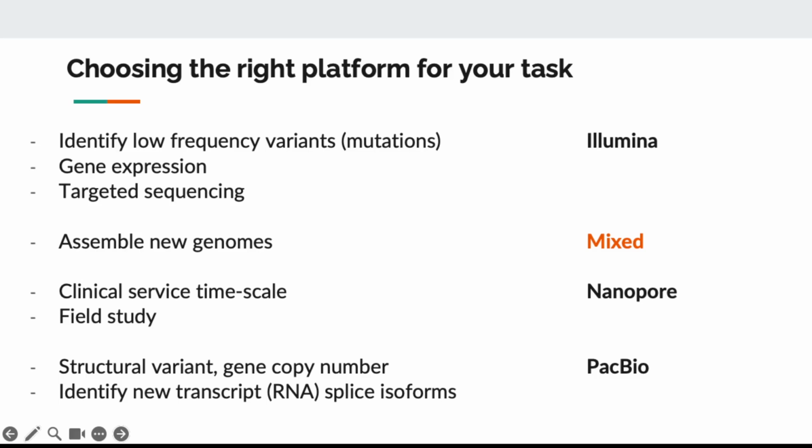So in that case, you need SMRT-seq from PacBio. Nanopore can give you roughly what happens on the genome, but if you want to know the actual mutation at the same time, you want to identify whether there are different genes being copied, then you need to be accurate. You need the accuracy on the nucleotide readout.